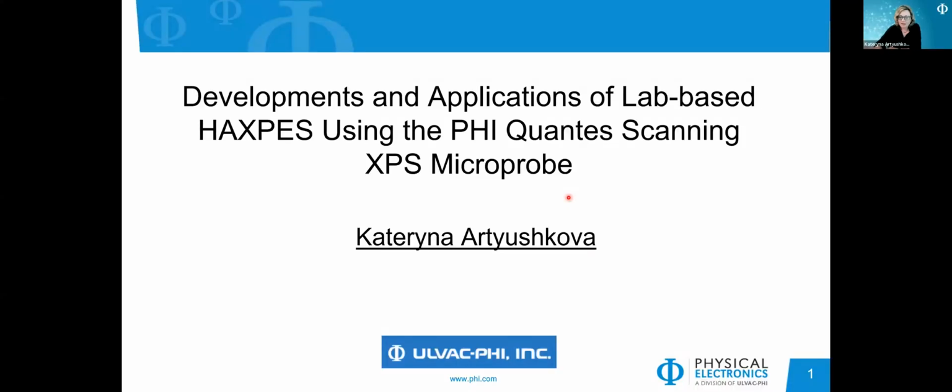Welcome, everybody. Today I will share with you some of the new developments and applications of lab-based HAXPES using our PHI Quantes Scanning XPS Microprobe instrument.